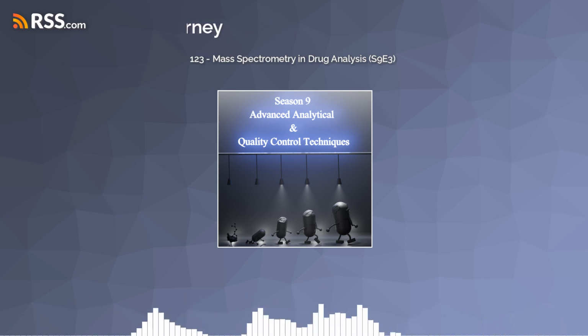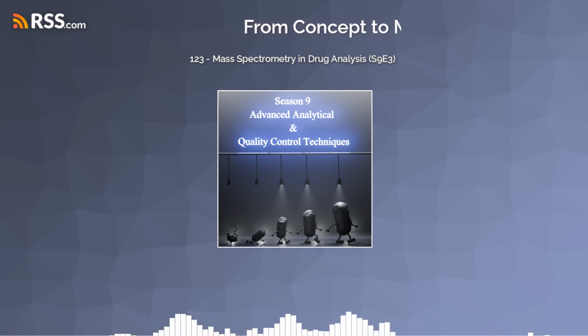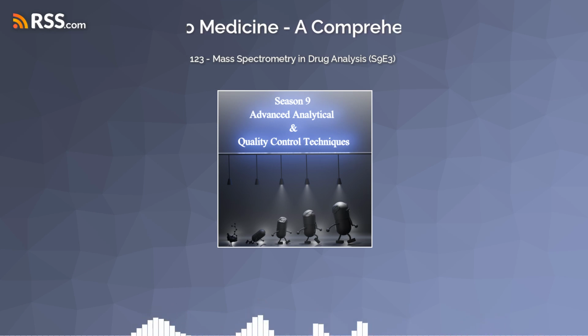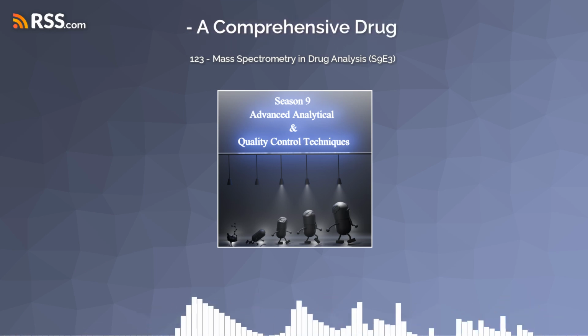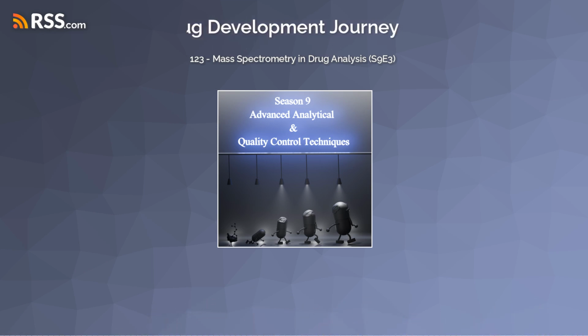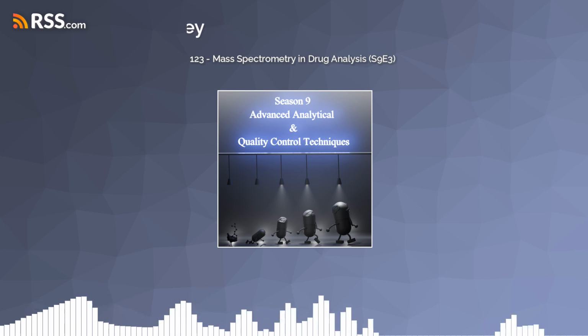Oh, exactly. And in drug analysis, that's crucial. Impurities might have structures and therefore masses that are incredibly close to the actual drug or other harmless compounds. High resolution lets us pinpoint the specific impurity we're looking for and separate it from the rest. Okay, so resolution is about being able to distinguish between things that are very similar.